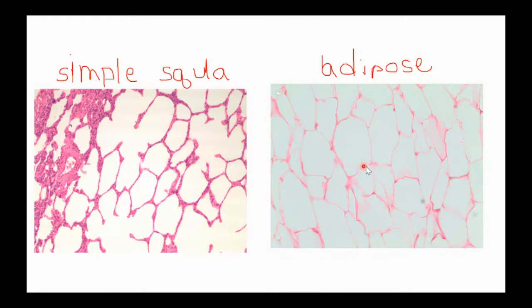If you look at this circle and it's a really thin line and there's maybe just one place where you see a dark spot, literally, that's where the nucleus of these adipocytes got pushed all the way to the outside of the cell. They only exist to store energy, so all of this space is filled with lipids. They'll push those nuclei to the outside.